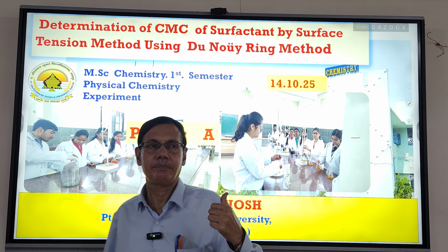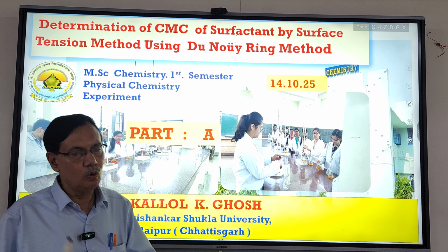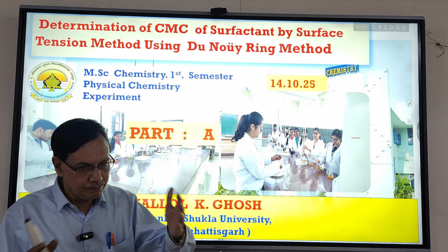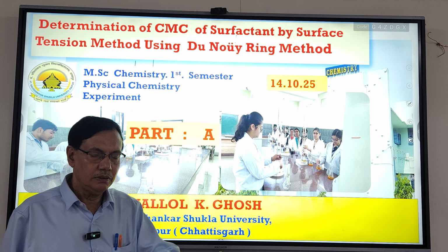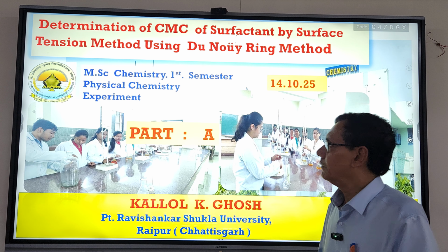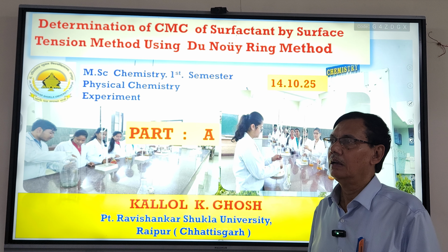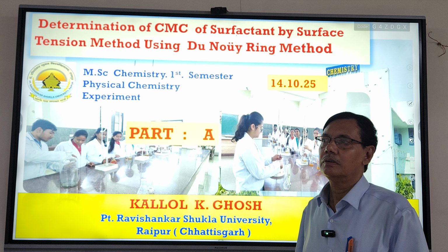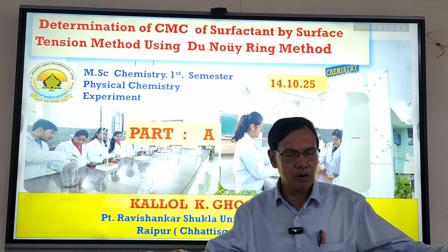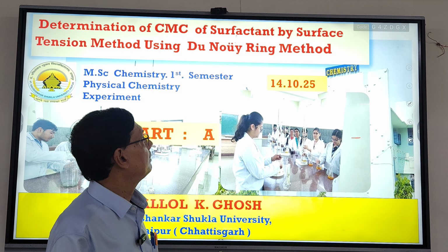In the first part, because whenever you perform any experiment, you must know the theory, the proper explanation of the chemistry involved in that experiment. So in the first part, very briefly I will discuss the theoretical part of that surface tension measurement, and in the second part I will perform one or two experiments with the help of my research scholar. So let me start the first part.